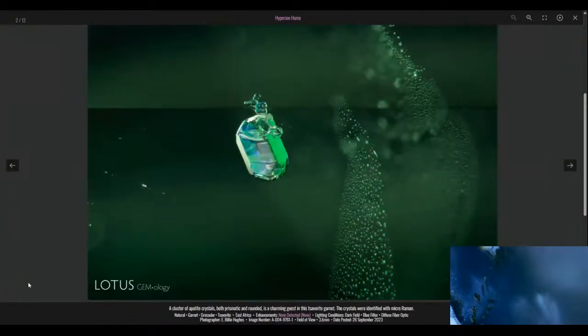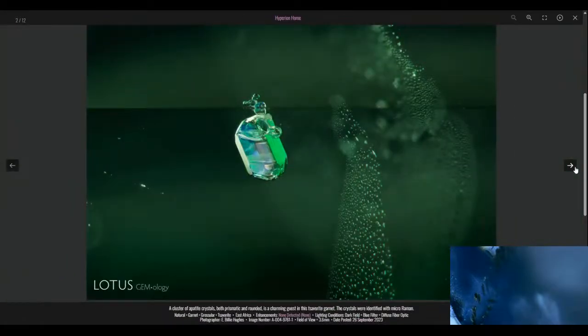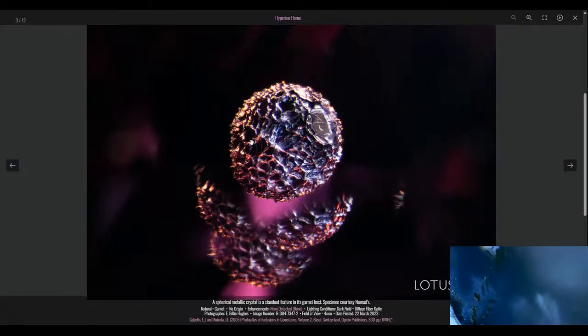So we see apatite. These are insane. This is super crazy.